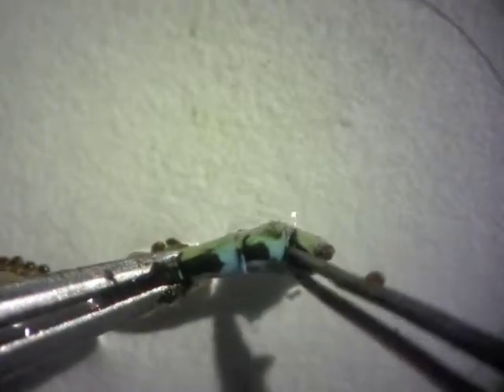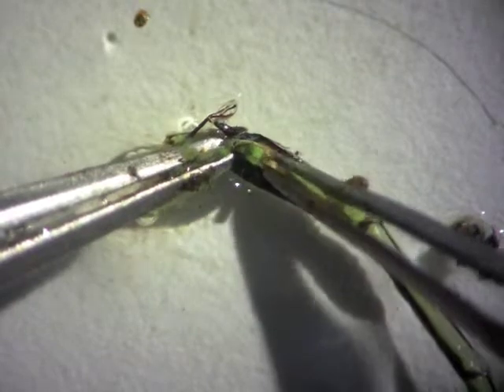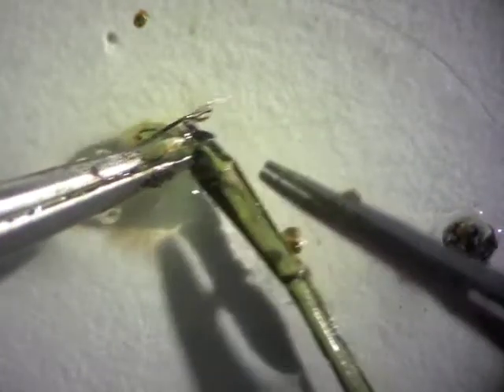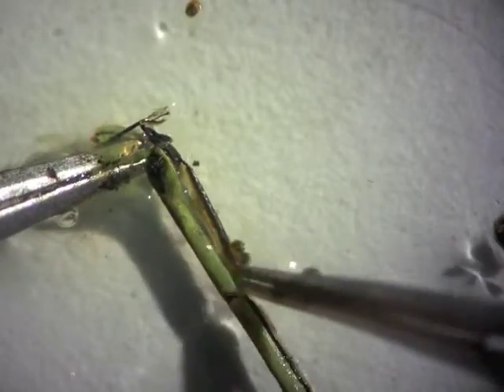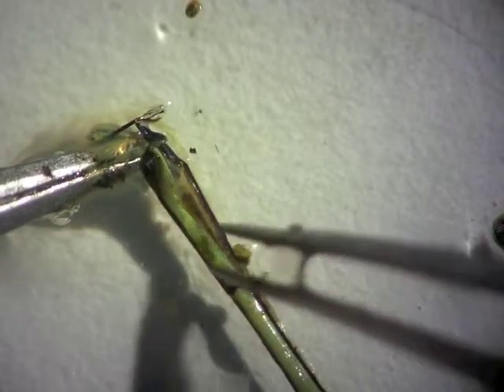Here is the posterior end of a damselfly. This is a male, and by removing the posterior end it'll be a little bit easier to take the gut out. You'll also notice that this individual has a lot of small mites on it. There you can see it's very small — this one hasn't eaten for a while, but that's the gut.